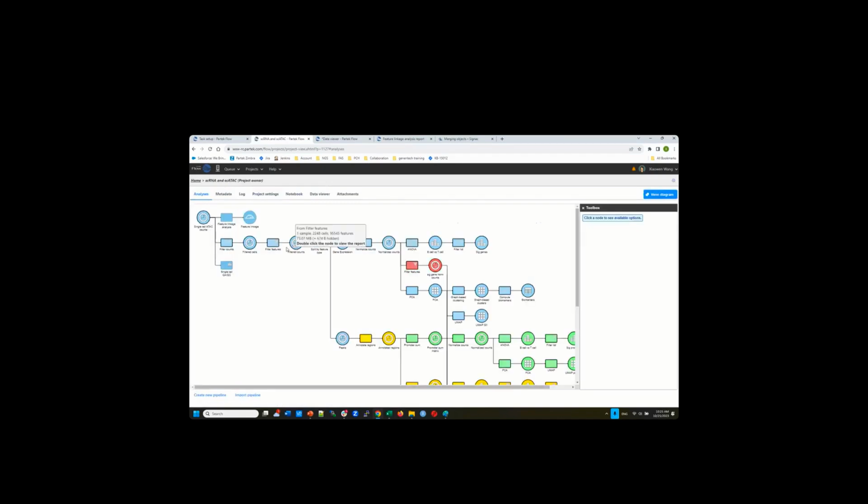And then when you mouse over, before I had 134,000 features, and here I got 95,000 features, including both genes and peaks. I used the same criteria to filter. But you can do this separately, for genes or peaks. But I would recommend that when you filter cells, you do it all together.